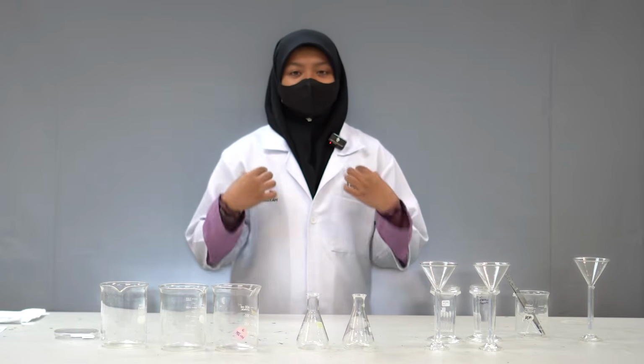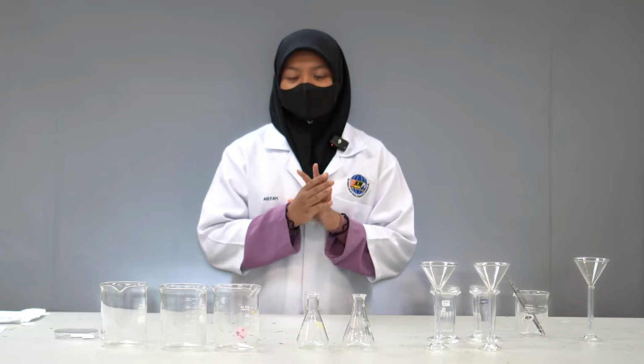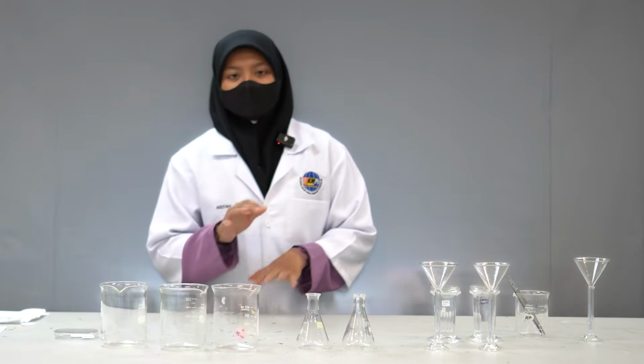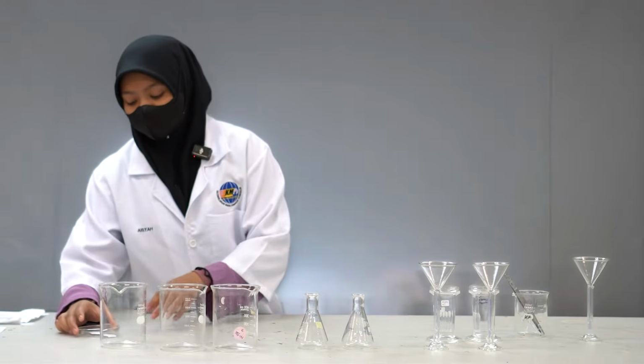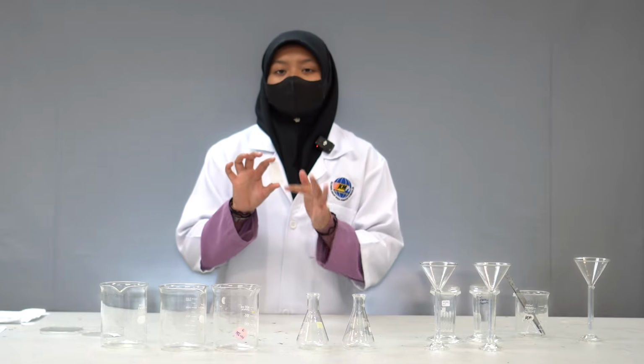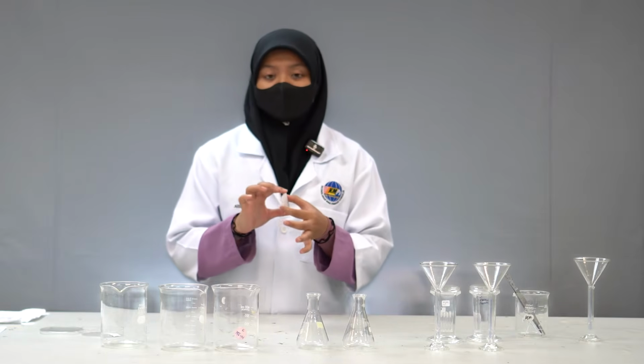Assuming that I have followed all the procedure, just wearing lab coat and also wearing gloves. Before I start, basically, as we know, TLC is a thin layer that's coated by silica gel.